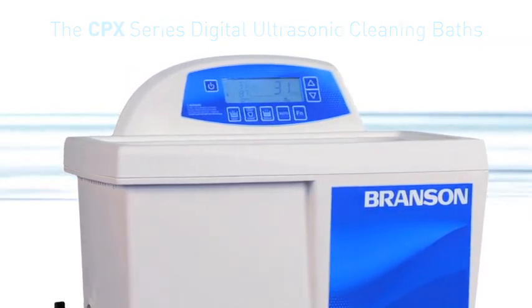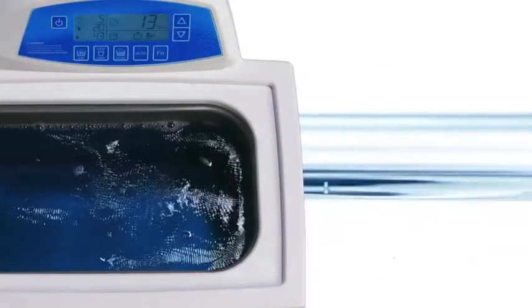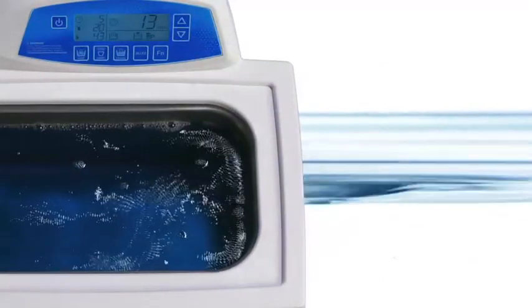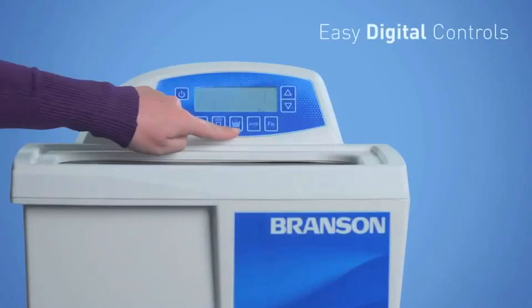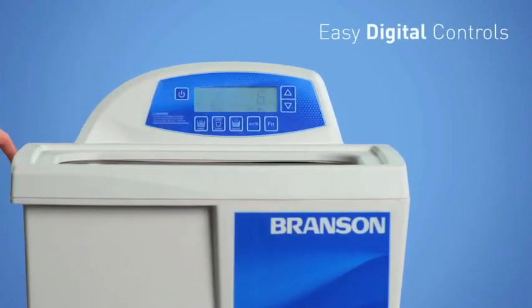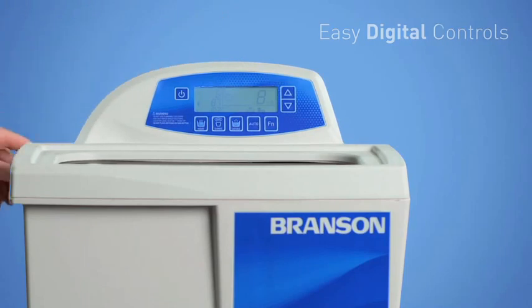Built with the same quality and durability as our mechanical ultrasonic cleaners, we've reimagined the Bransonic bath for complete control, enhanced precision, and consistent cleaning for any user. It starts with a newly designed clear digital display. These easy-to-use controls give any operator the ability to perform precise, powerful cleaning with limited room for error.